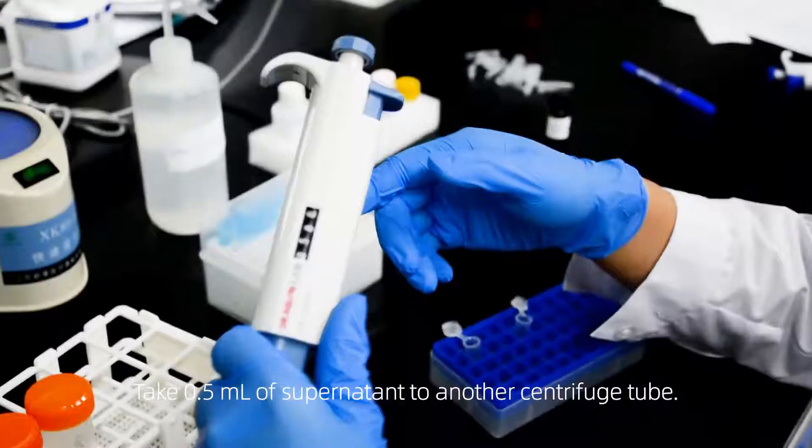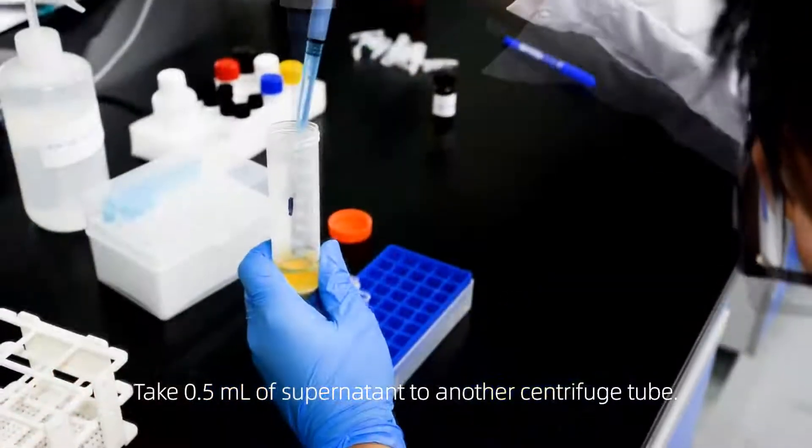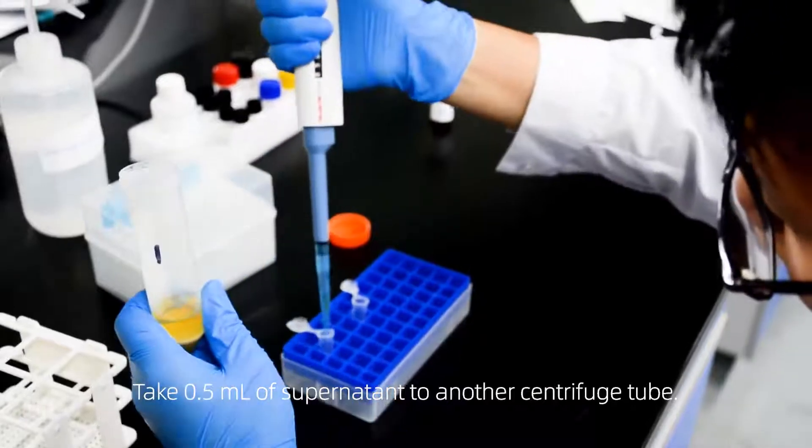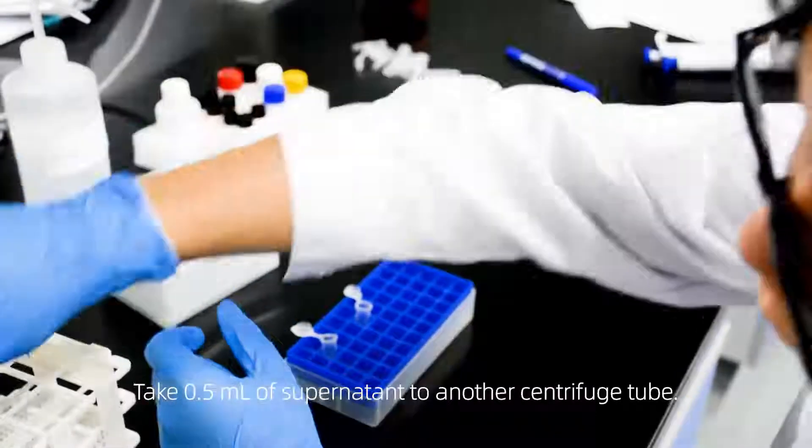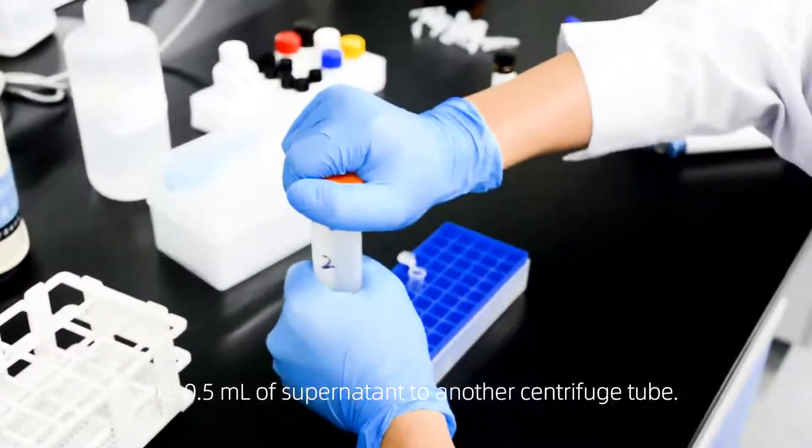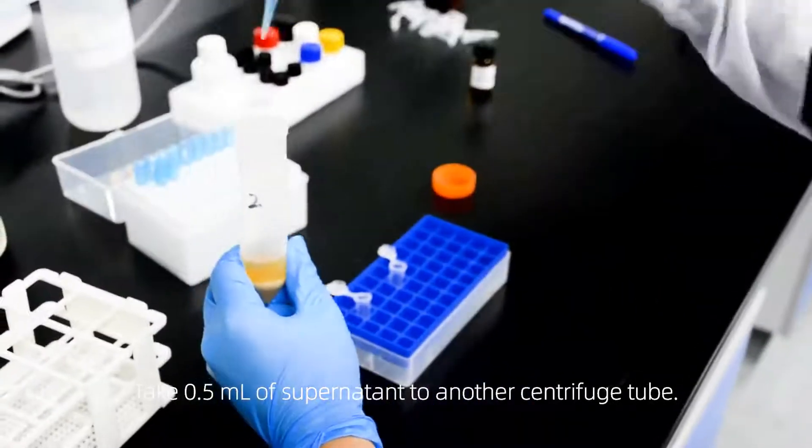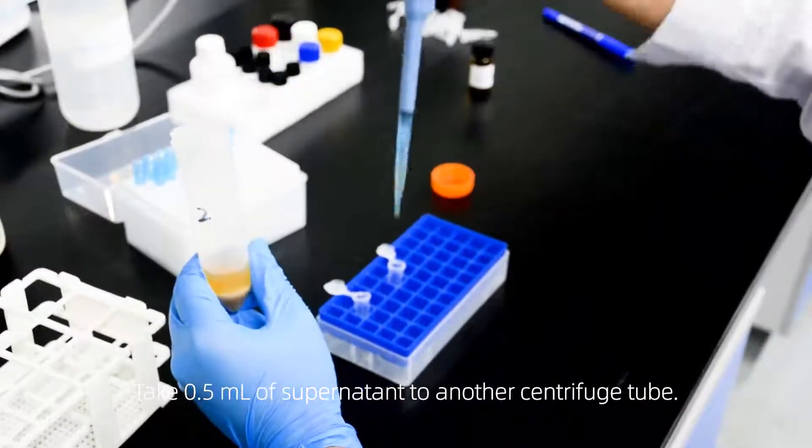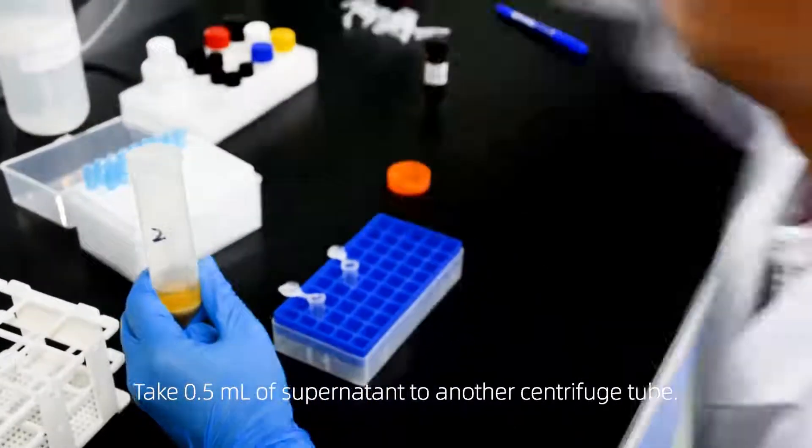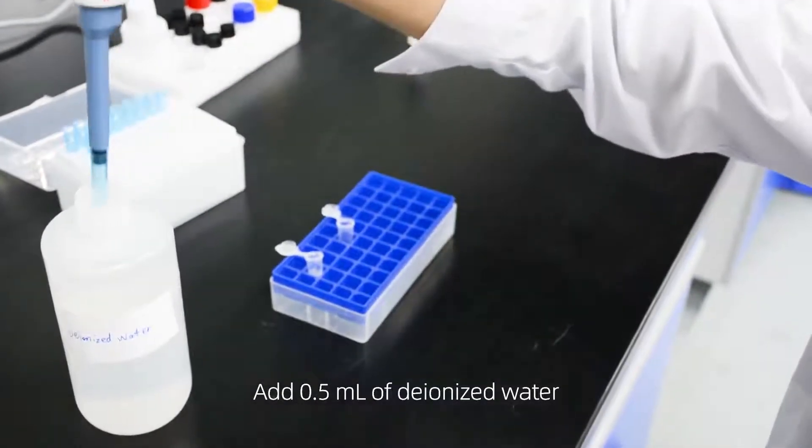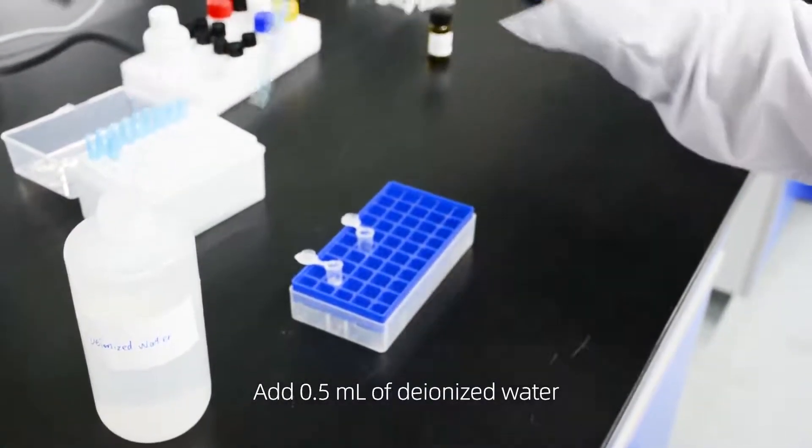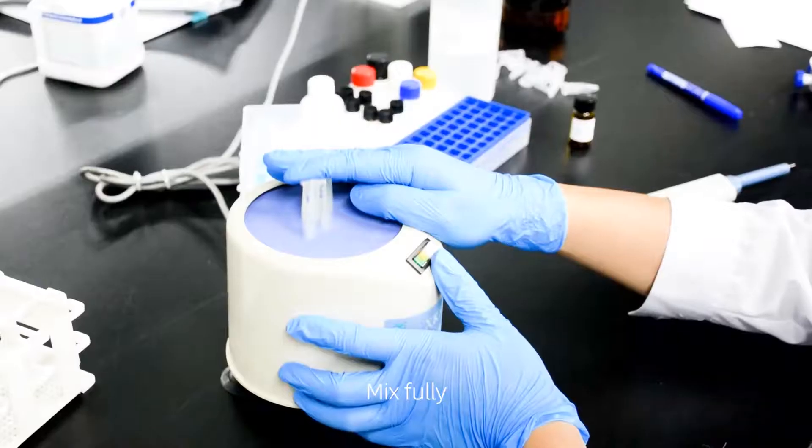Take 0.5 milliliters of supernatant to another centrifuge tube. Add 0.5 milliliters of deionized water and mix fully.